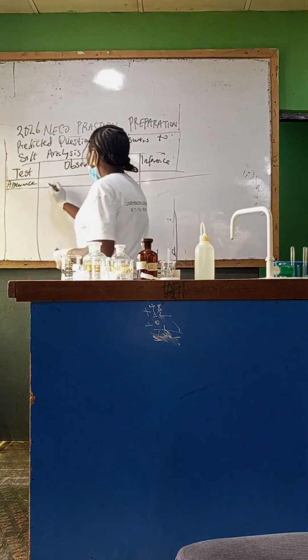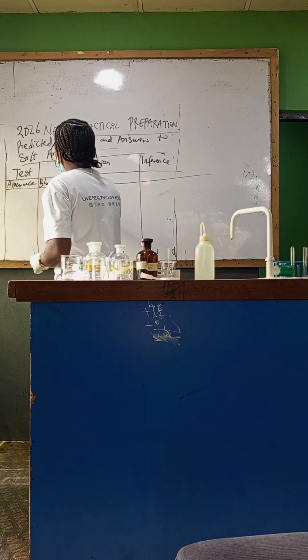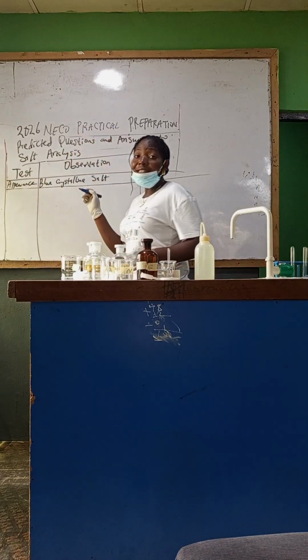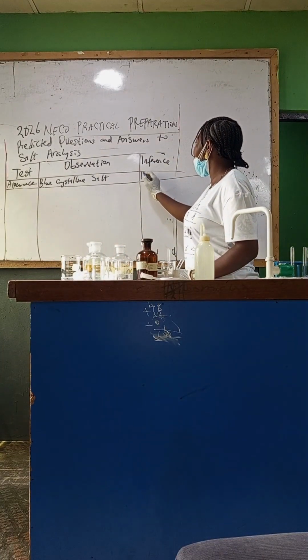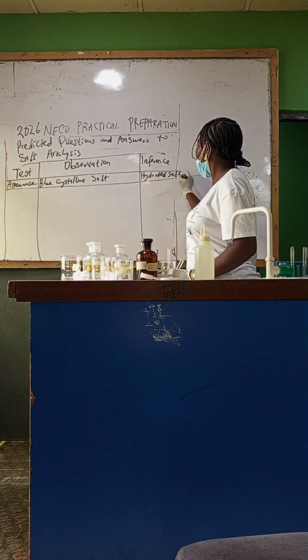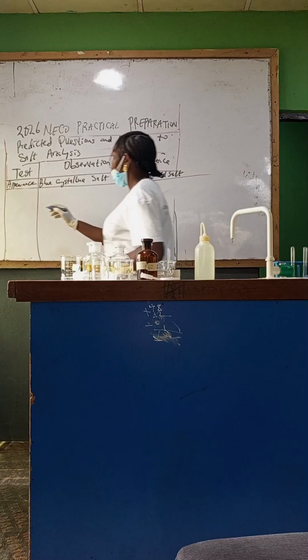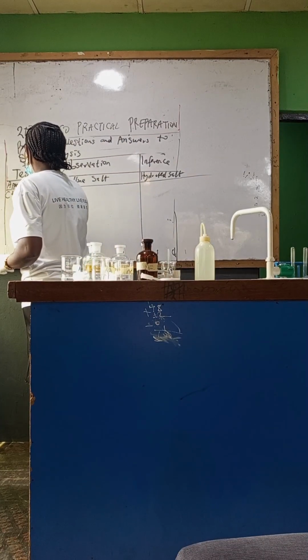Appearance: it is blue crystalline, and that tells us that it is a hydrated salt. Then the next one, C plus distilled water.